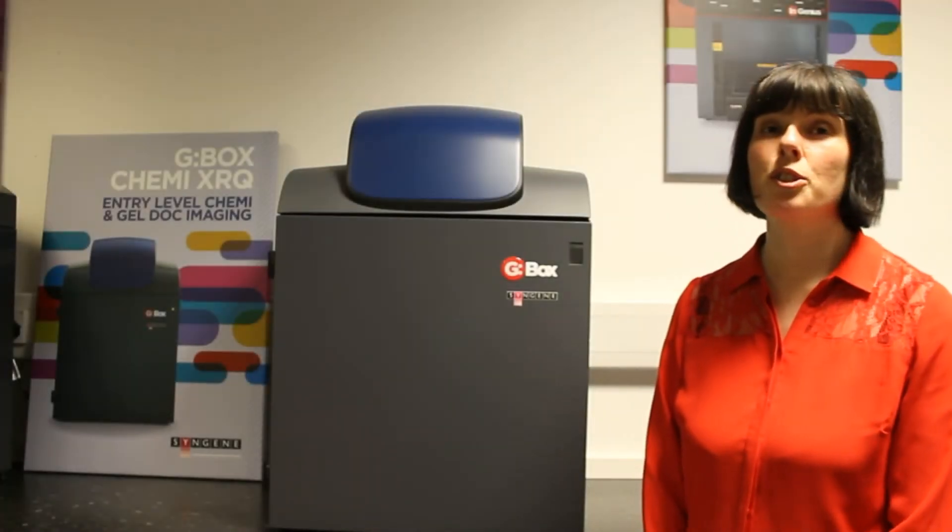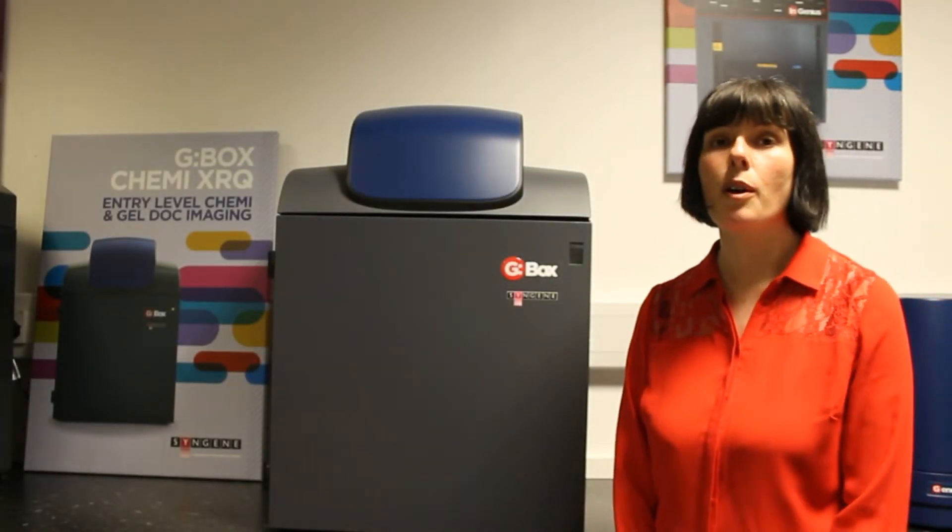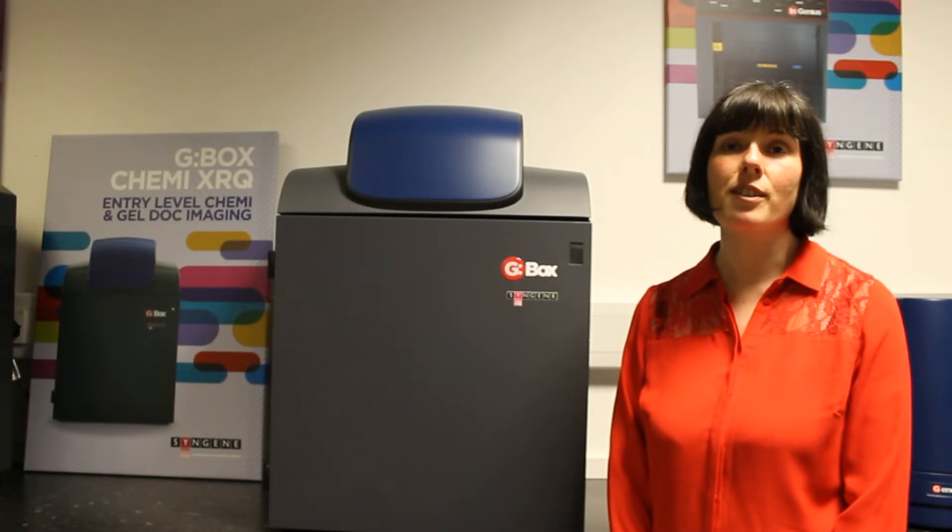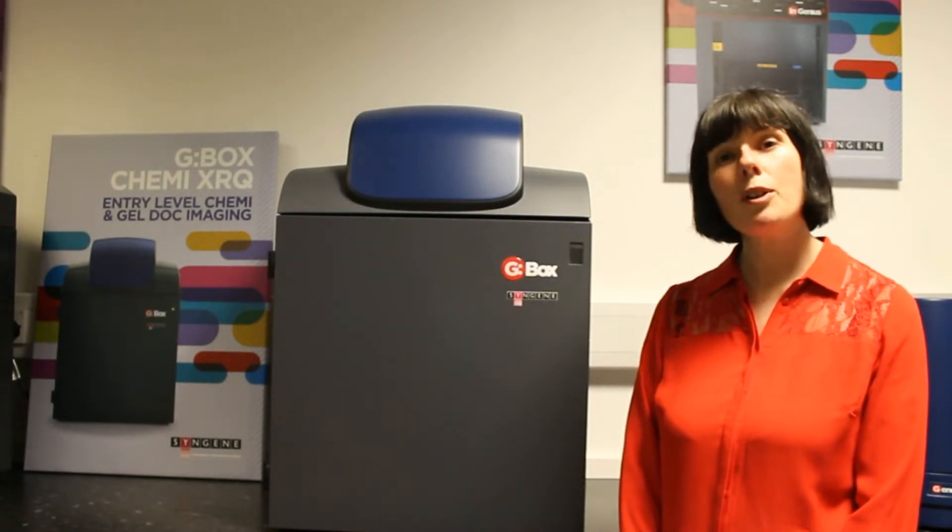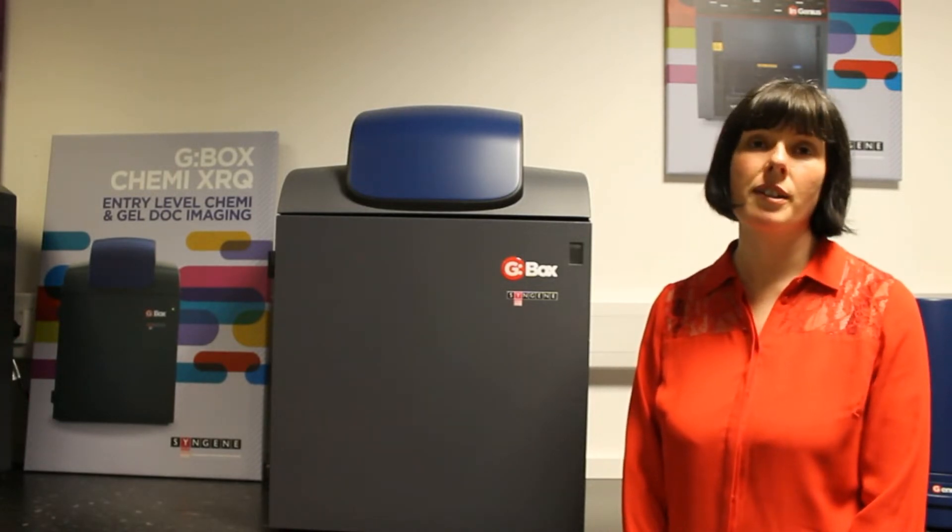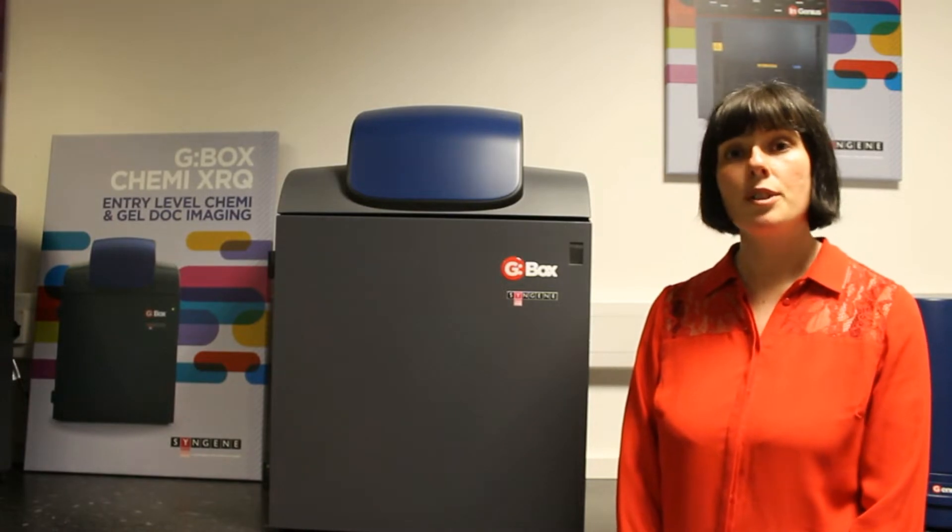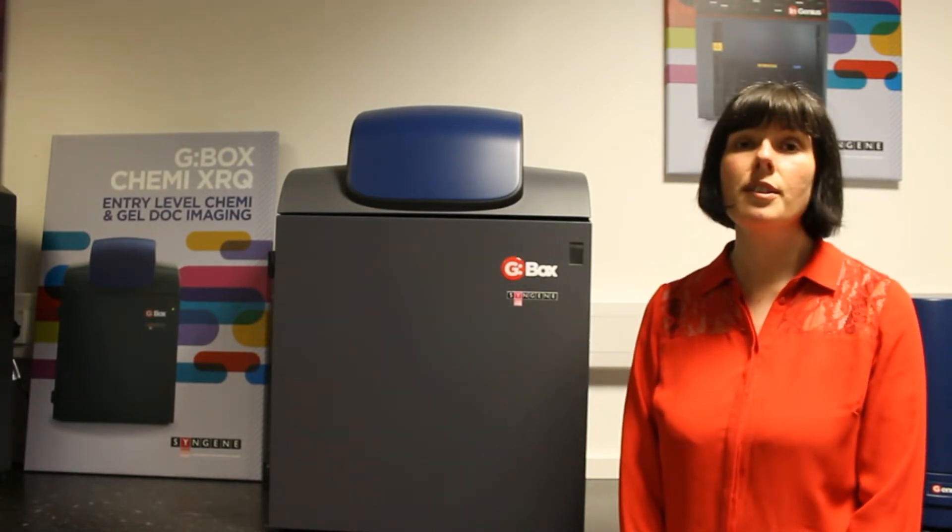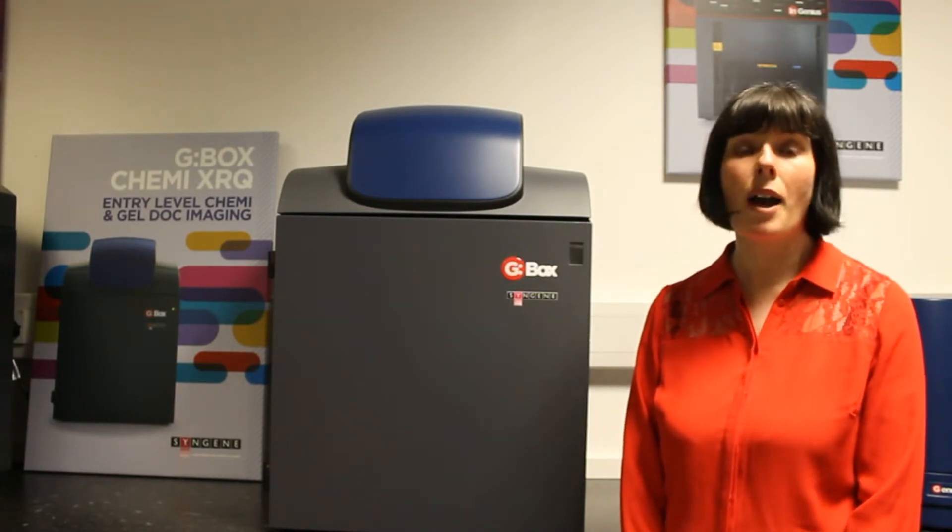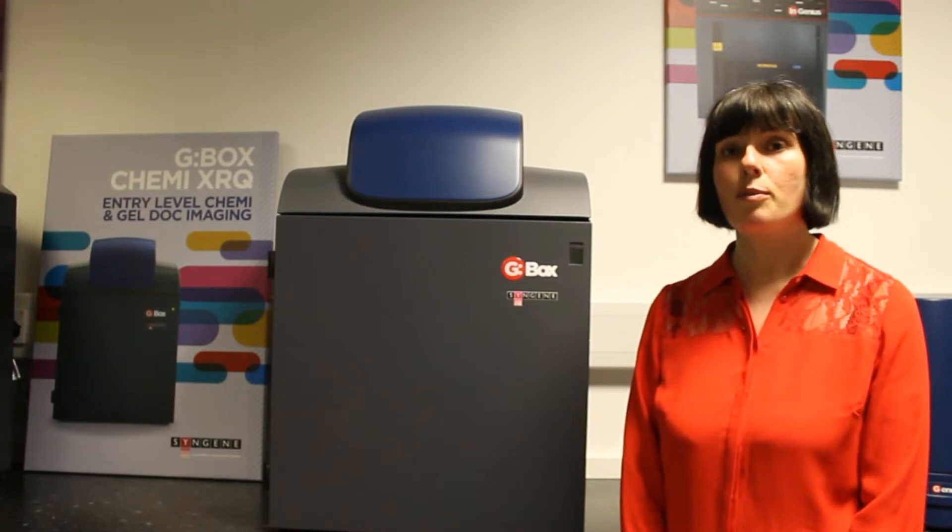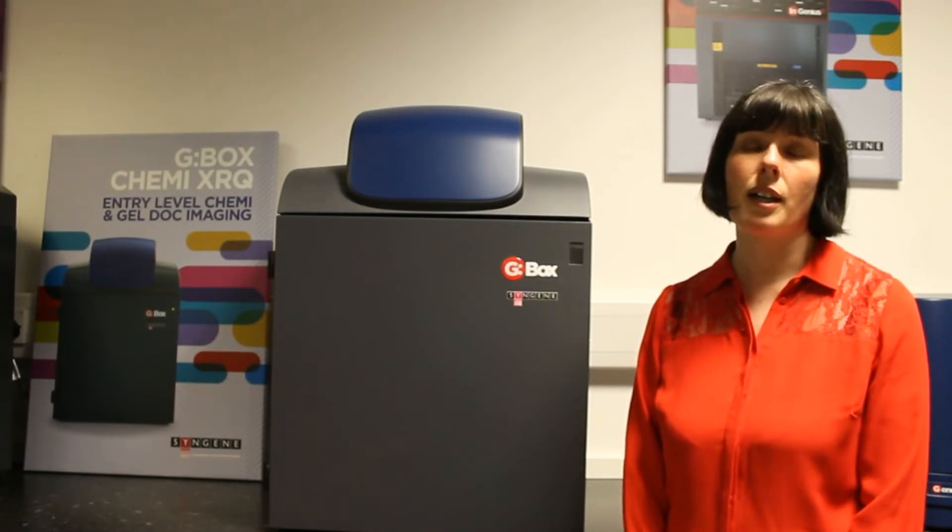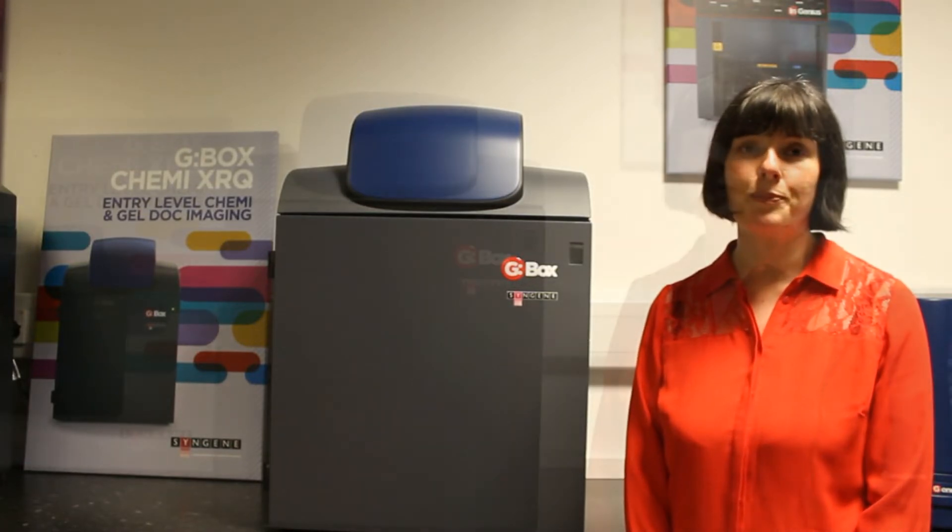Welcome to the short introductory video on the G-box Chemi XRQ system. For a laboratory that needs hassle-free chemiluminescence detection as well as routine gel documentation, using the G-box Chemi XRQ's powerful Genesis software to switch between applications is simplicity itself.